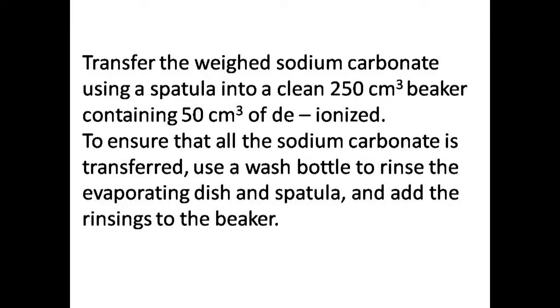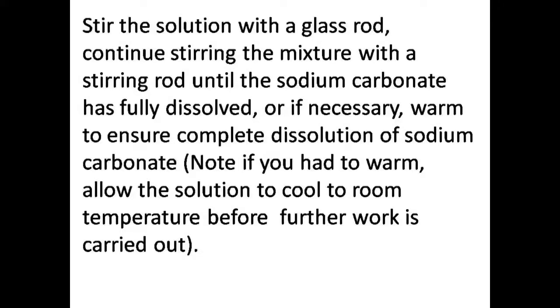To ensure that all the sodium carbonate is transferred, you use a wash bottle to wash the evaporating dish and the spatula, and you add the rinsing to the beaker. Then you stir the solution with a glass rod. Continue stirring the mixture with the stirring rod until the sodium carbonate has fully dissolved, to ensure complete dissolution.